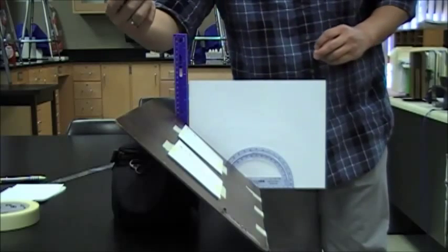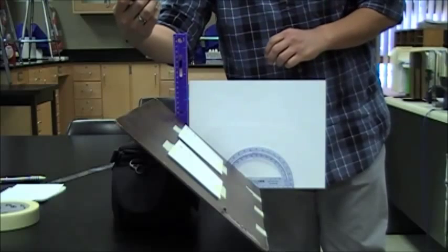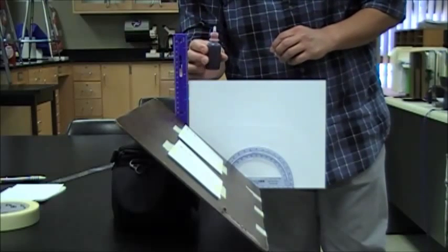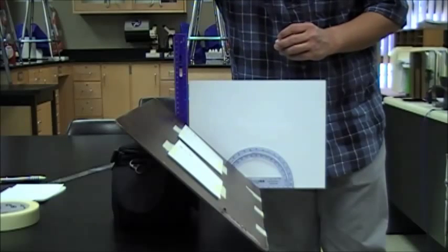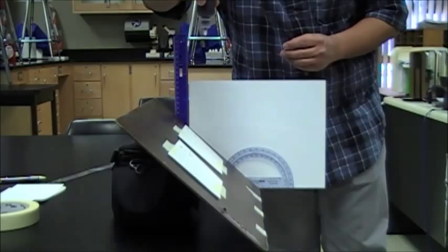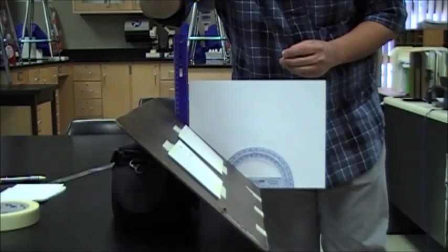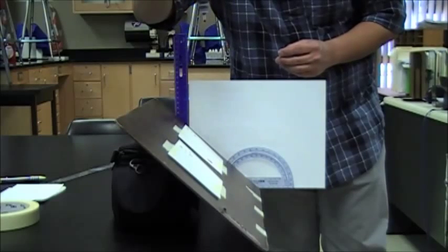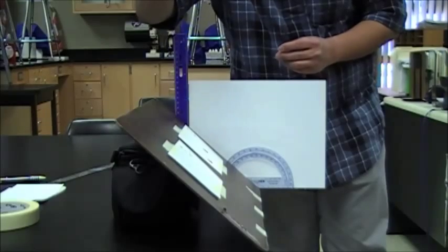From a height of 30 centimeters, take your simulated blood and carefully drop two drops side by side on the white index card at your assigned angle. The first drop is trial one. The second drop is trial two.